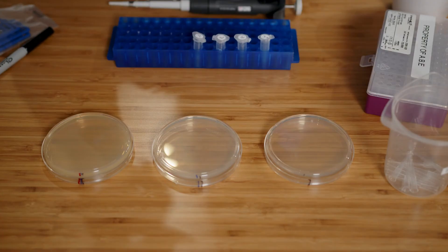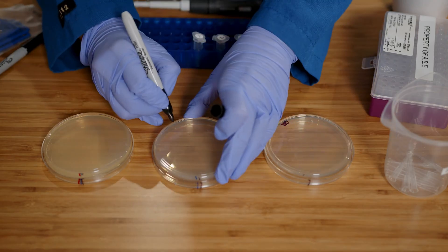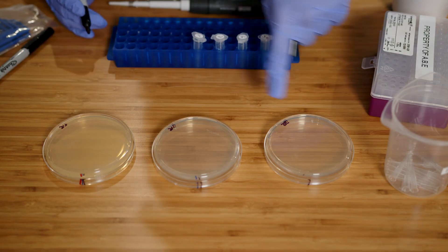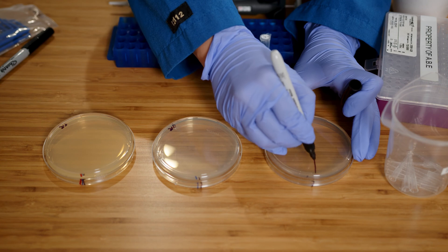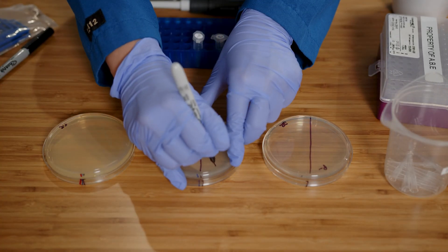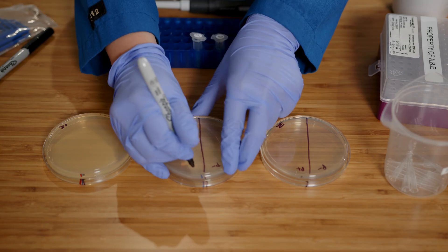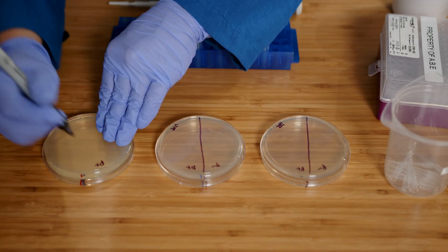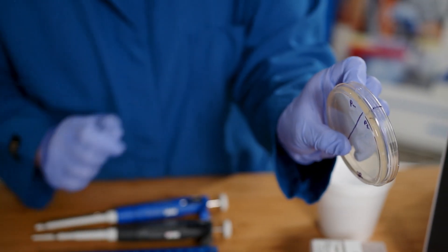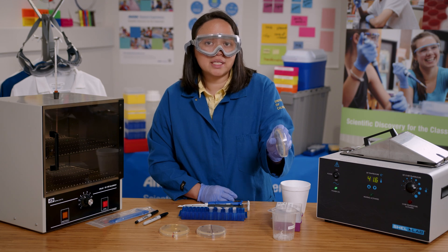First, I'll label the plate with my initials. Then I'll draw a line down the LB and LB amp plates and label one side of each with P- and the other side with P+. On the LB amp arabinose plate, I will only write P+. Notice that my plates are labeled on the outside and on the bottom of each plate, and that the writing is small and on the edges of the plate so that most of the plate is still visible.